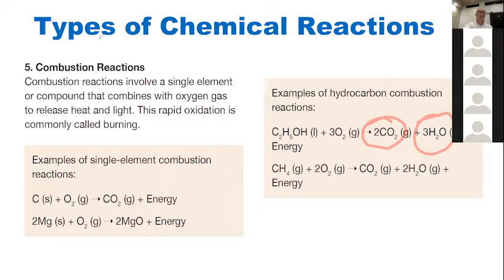When we see a rapid oxidation, we're going to call it burning. So not only are we going to burn a typical hydrocarbon like a candle, we're also going to burn iron, which you may not have seen before. Iron burns too. In fact, pretty much all metals will burn, because all metals will oxidize, with a couple of exceptions. If you make the metal particles small enough, they will burn rapidly.